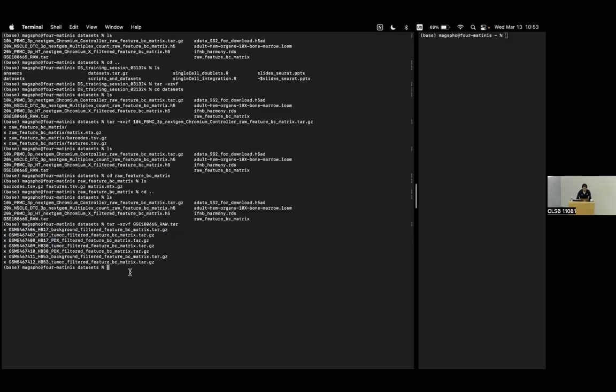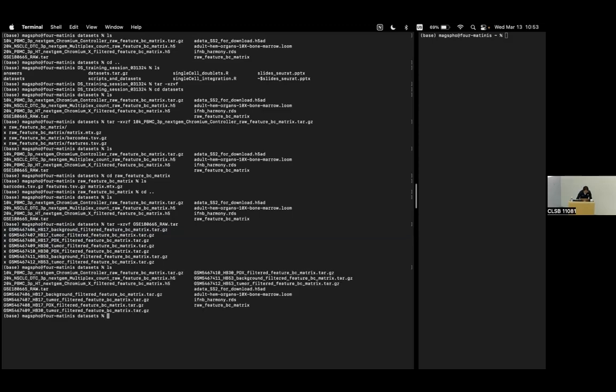And here I'm going to do a for loop in the command line. First we can create a directory called integrate, and then move everything into it.